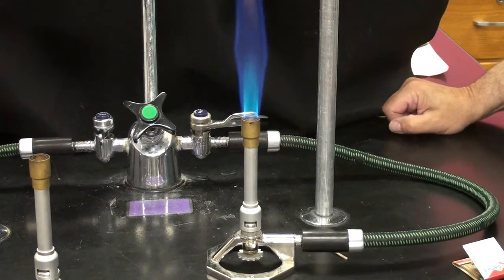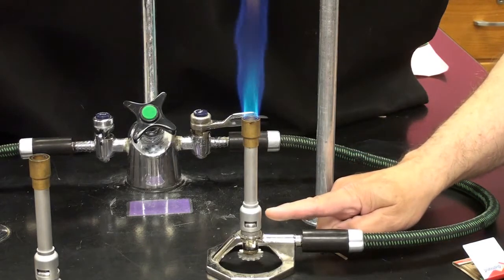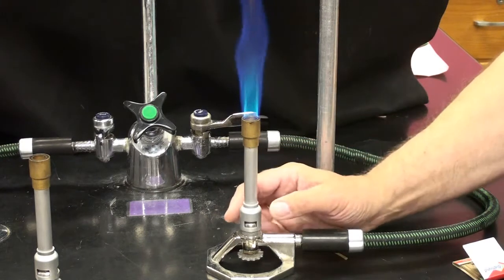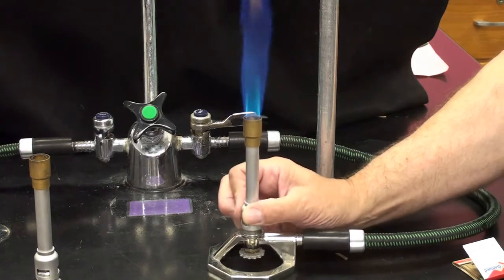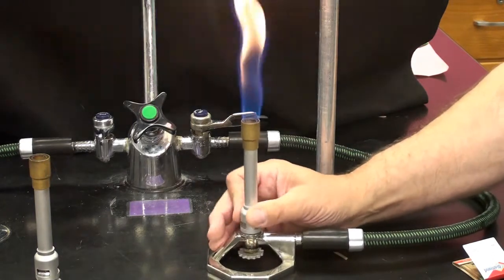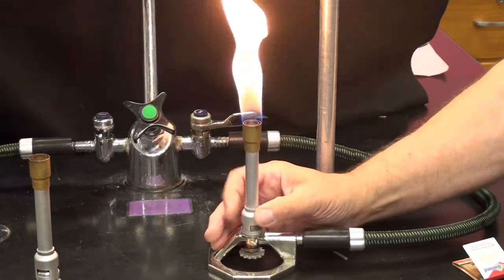So one of the things you're gonna have to do on this next lab is draw both those. Draw what the flame looks like with the air intake open and closed. It's open right now. Which one of those is hotter? That's another thing we wanna find out. So is that yellow flame with the air intake closed hotter? Well, let's find out. How can we find out?